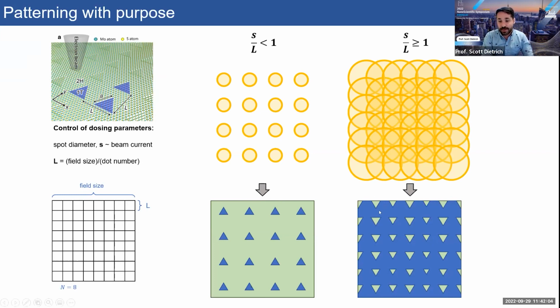Generally, you'll have maybe some leftover semiconducting islands, quantum dots, in this metallic background. But here we're aiming for mostly 1T phase. We're going to get a specific size coverage. If this was a 1 micron box, we'd have a lot of points in there, and we'd like to have it be all metallic. Typically for this study, we used a ratio of about 3. So the pitch was about 1/3 of the spot size.